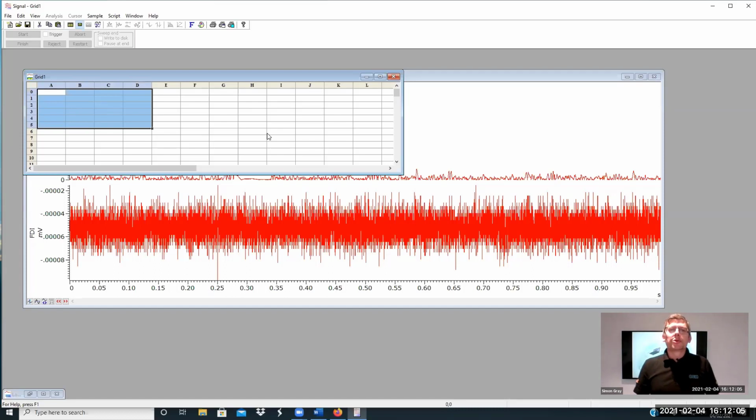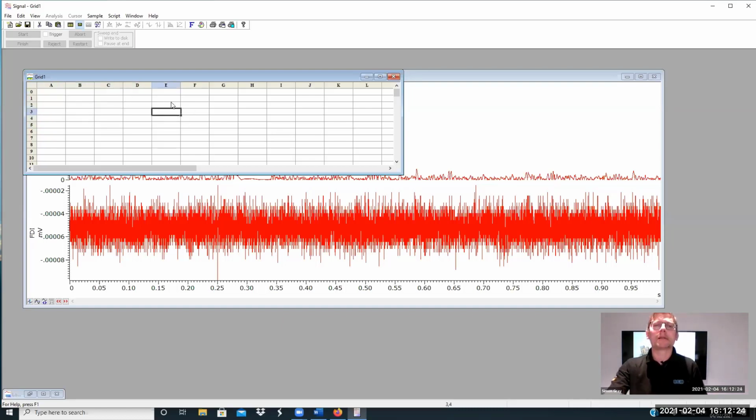I find it much more useful when using a script. So a script, a program, a macro, if you like, running under Signal here, can generate measurements per frame or multiple measurements per frame, the results of which as text can be automatically pasted into these individual cells. Now that makes it much cleaner, much nicer to look at than perhaps trying to format a text file.